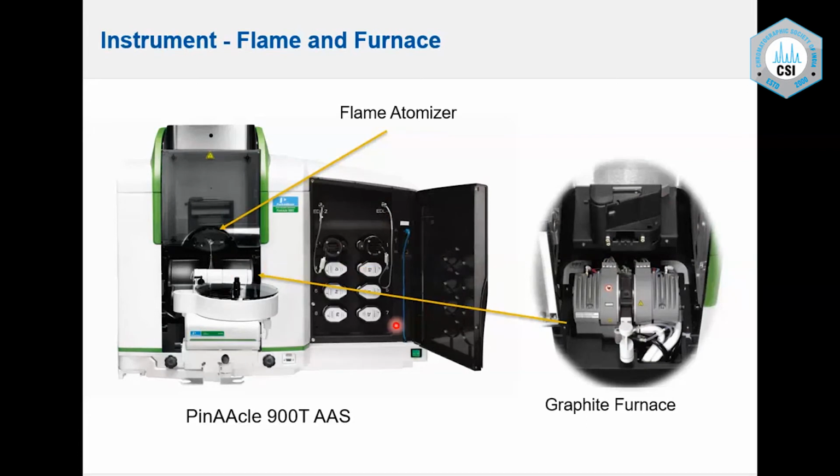This is how the lamps actually look. There are coded lamps and non-coded lamps available. You can fix it here, so automatically the instrument senses which lamps are there and automatically ignites the lamp and you get the signal.